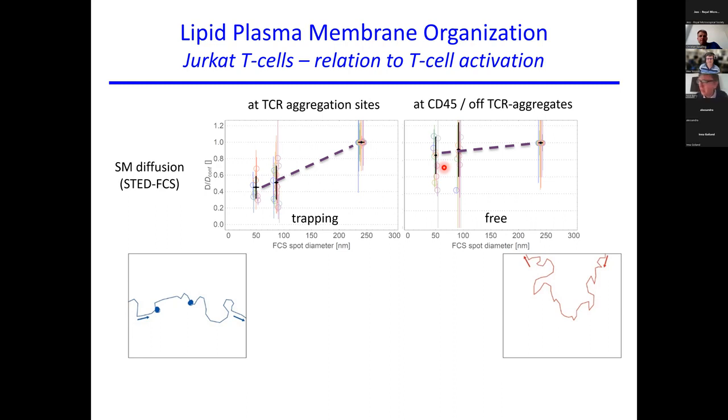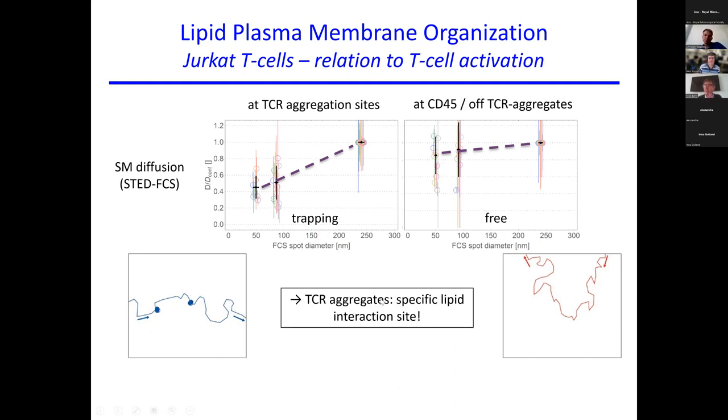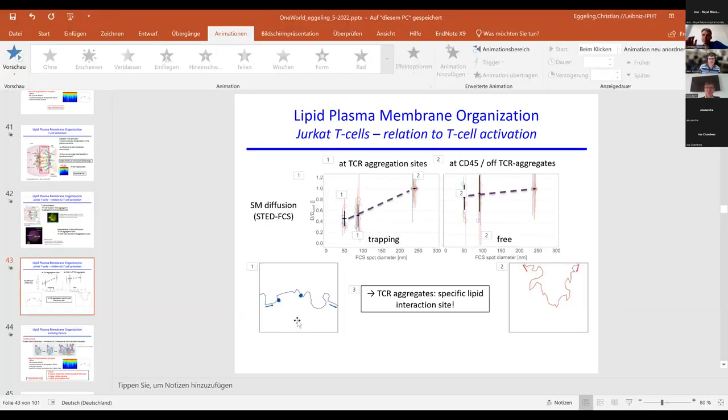So towards the end, you were talking about MINFLUX and single particle tracking, MINFLUX and what have you. Is the highest temporal resolution in any of these still FCS? It's the measurement interval, let's say, that your system is capable of that gives you the highest temporal resolution. Is FCS still the fastest of all of those? I would say in principle, for FCS, the resolution is given by how fast you can detect consecutive photons from the same molecule. And in principle, that's the ruling factor for each technique.